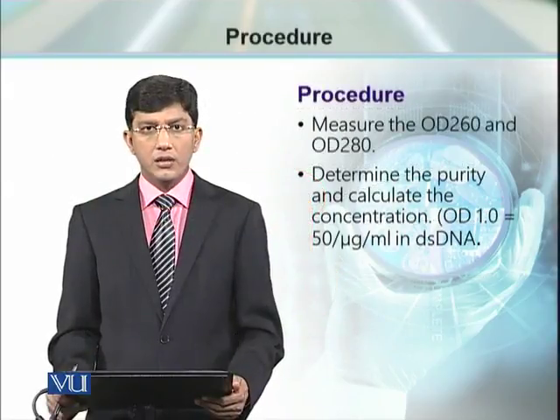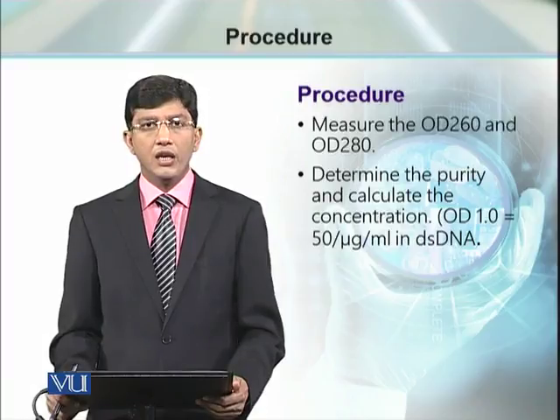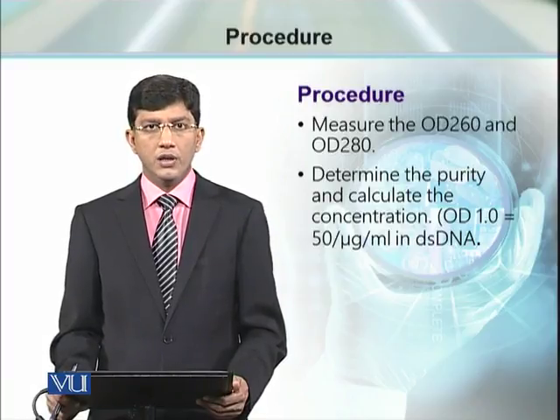Using this standard curve, now determine the purity and calculate the concentration of the DNA in any unknown sample. And this concentration now can be used for further experiments which you want to do using this DNA sample.